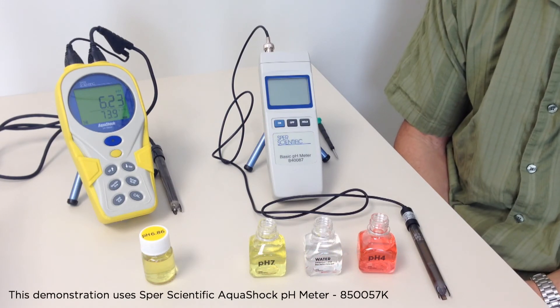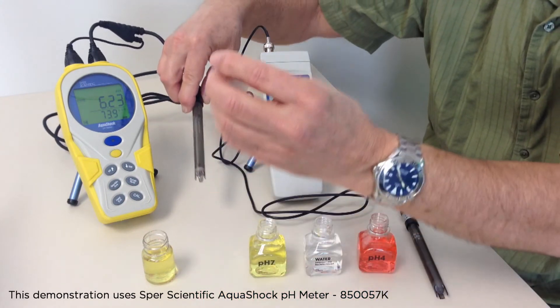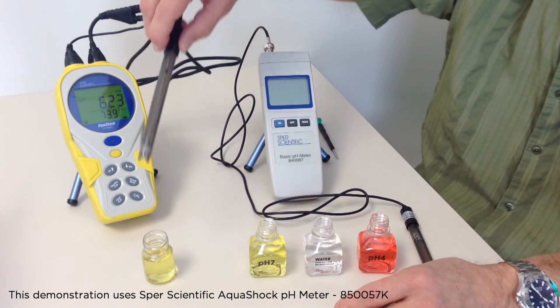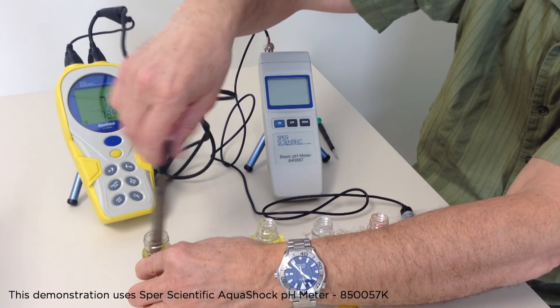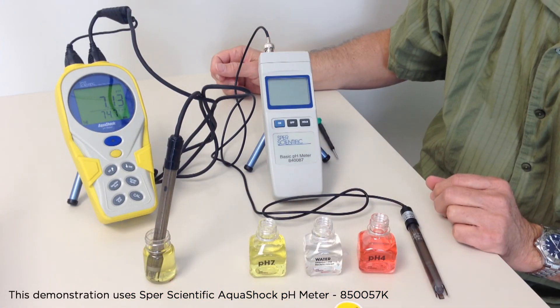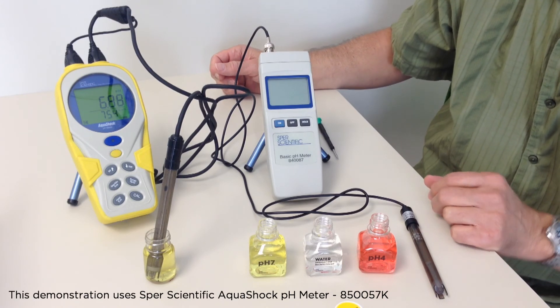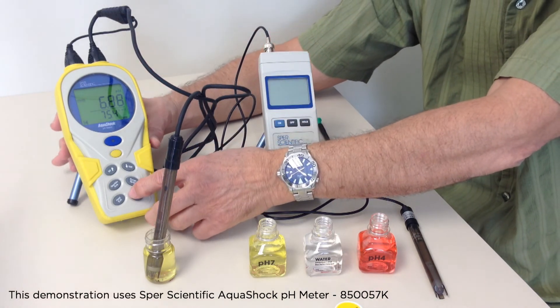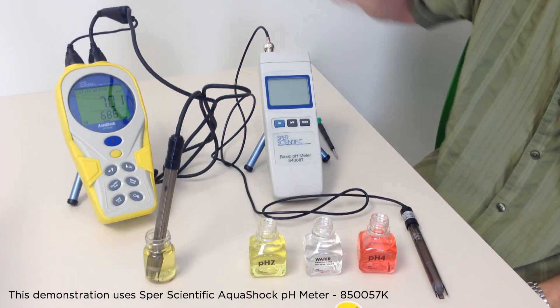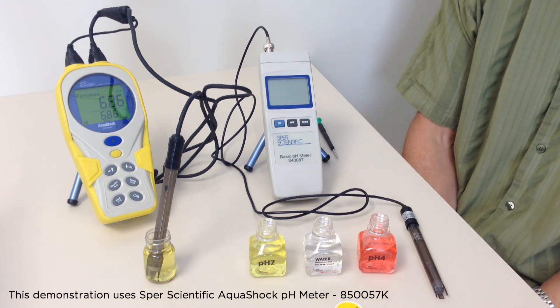We'll next calibrate a meter that uses automatic buffer recognition. In this case, the meter uses not pH 7, but pH 6.86 — each meter may be a little bit different. This is a buffer solution that should read 6.86. We let it stabilize, and as you can see, it's very close but not quite there. All we have to do is hold the calibration button down for two seconds, and the meter recognizes the buffer solution as 6.86 and calibrates itself to the solution.